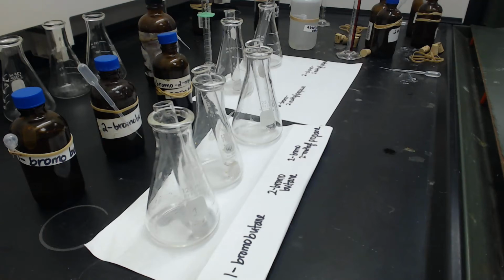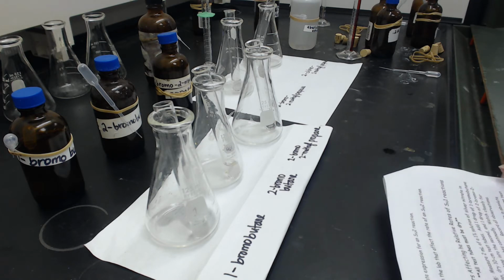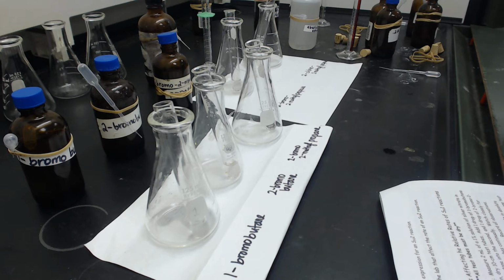Okay, this is the relative rates of nucleophilic substitution reactions, and now I'm doing part B, which is determining the factors affecting the rates of an SN1 reaction. So, first I'm going to look at the effects of the structure.